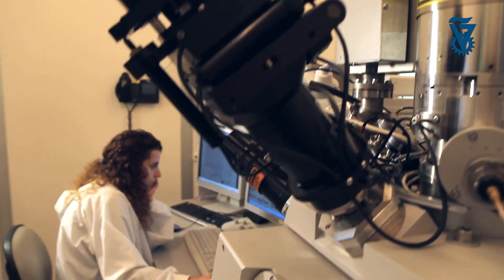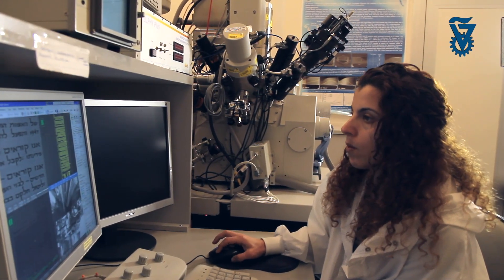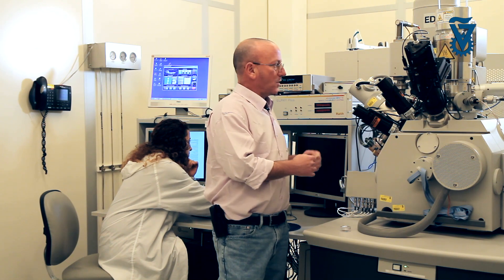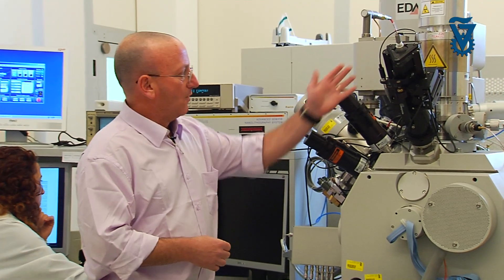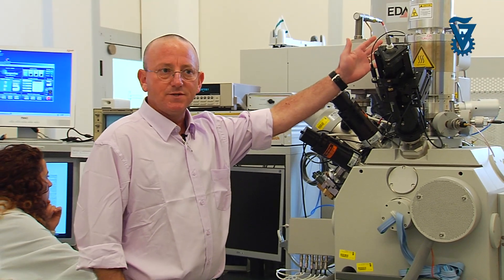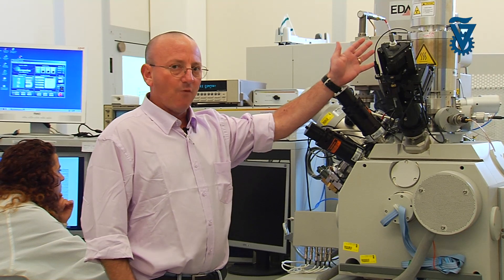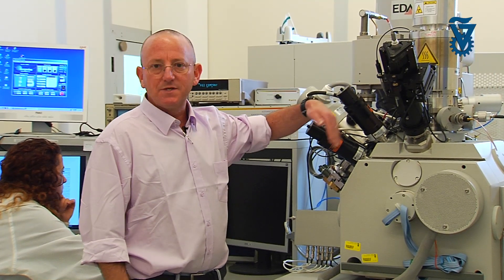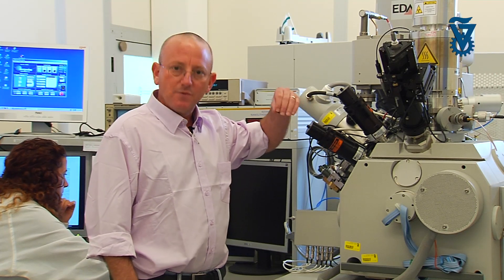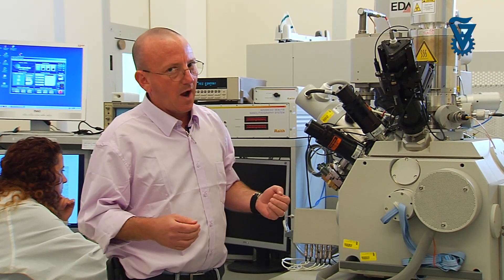This is a focused ion beam system — actually, it's a dual focused ion beam system. In principle, it's a scanning electron microscope, so from here we have an electron source with electromagnetic lenses, and we use them to form a focused electron beam which rasters across the surface of the sample. As a function of the position of the electron beam, we acquire signals from which we can form an image at very, very high resolutions.